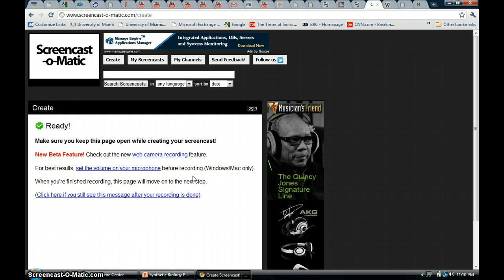in mice, or in vertebrate species like zebrafish, or in Drosophila. So today I'm going to show you about the GAL4 UAS system, which can be used, and we are going to find out restriction enzyme sites in the GAL4 UAS system.